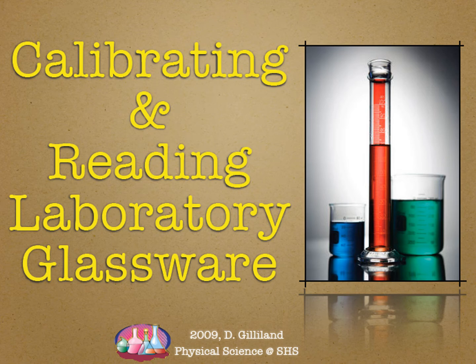Hello again. This is part of Pre-ACE Chemistry Chapter 0, all about working with scientific skills. So when you're in the lab, it's important that we know how to calibrate and read glassware. We went through calibration a little bit, but we will review that as well, because a graduated cylinder is basically like a ruler, but vertical.